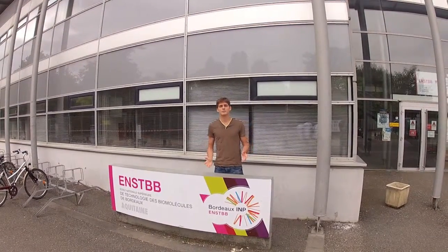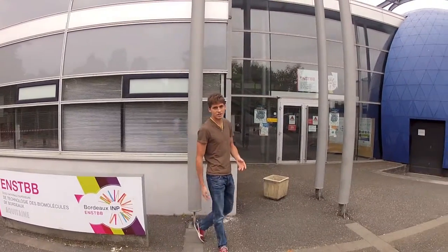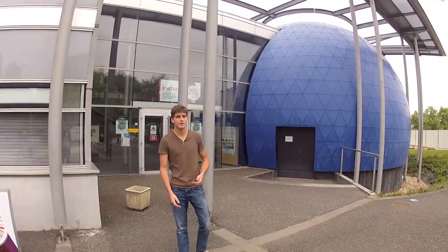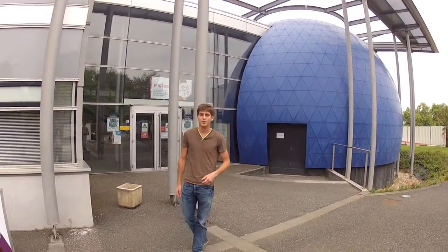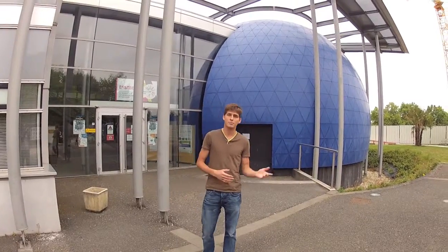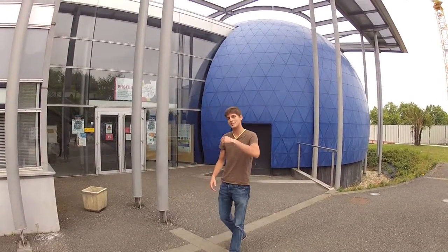Welcome to ENSTBB, a school specialized in production, purification, and characterization of biomolecules. You may now be able to recognize it thanks to that giant blue ball right behind me. Today, biotechnologies are used to produce drugs such as vaccines, antibodies, or recombinant proteins. If you want to see how it works, let's go inside.